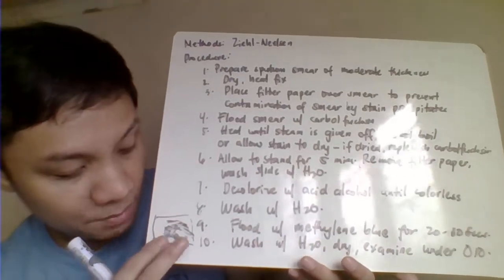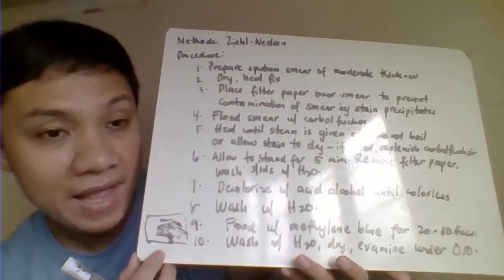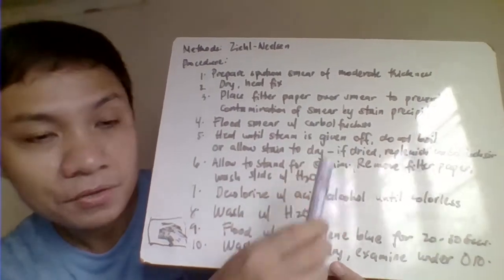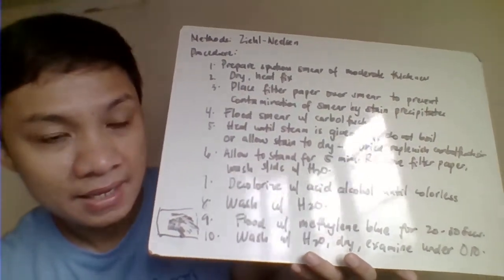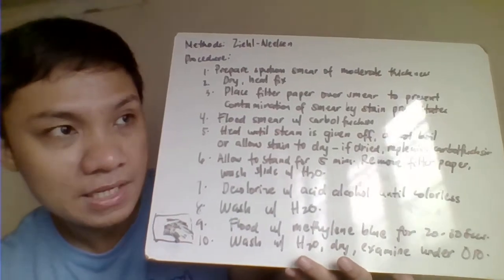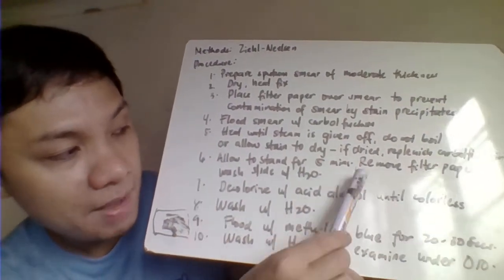So pag may primer stain na siya dito, you try to heat. Heat mo over the flame. Make sure na mag-heat ka lang until na magkaroon siya ng steam. Do not boil, and make sure na hindi siya nag-dry. Pag nag-dry ang smear natin during the heating process, you need to replenish again with your carbol-fuchsin. So, mean to say mag-add ka ulit ng carbol-fuchsin. Allow to stand for 5 minutes.